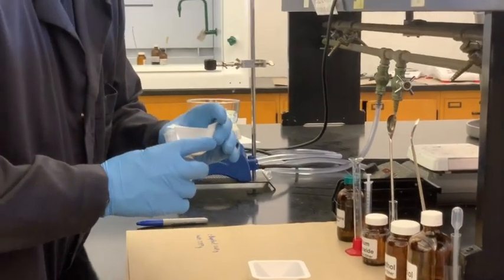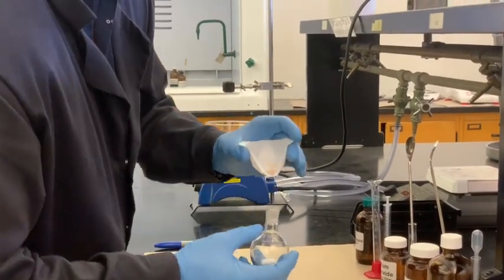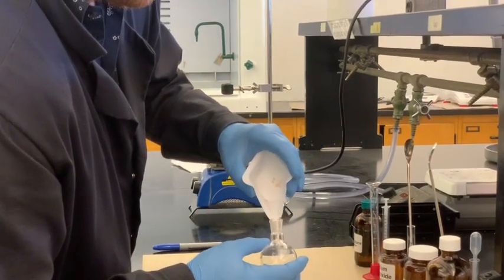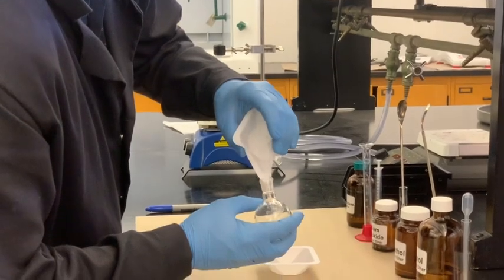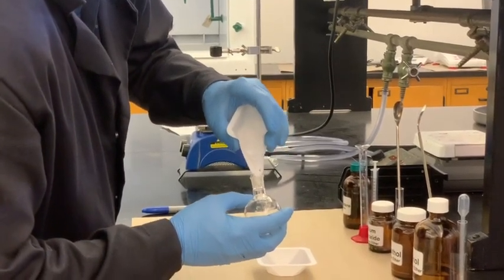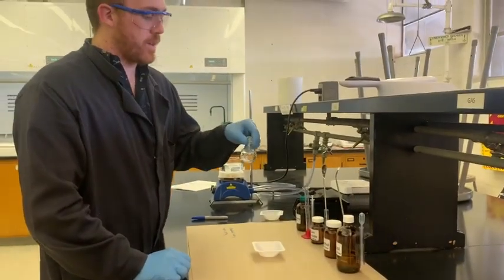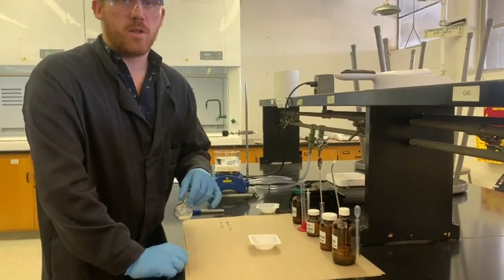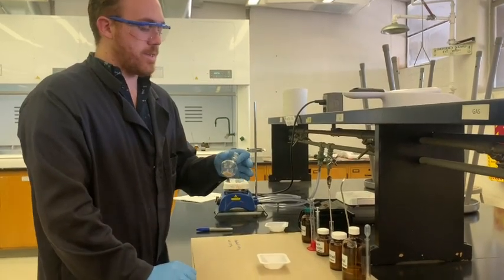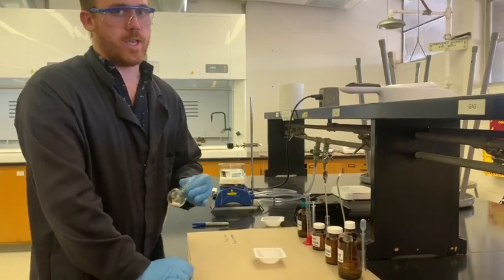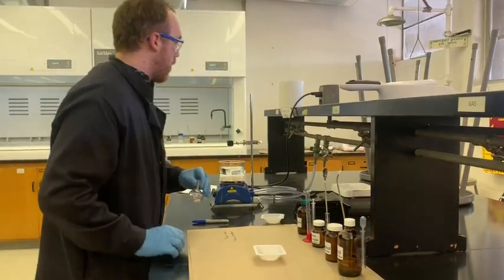So this is just 2-naphthol, it's got a couple of colored impurities in it. Want to get as much of it as you possibly can. We're not going to actually add the sodium hydroxide yet, just because it's not necessary. You want this 2-naphthol to really be fully dissolved before you actually add the sodium hydroxide.